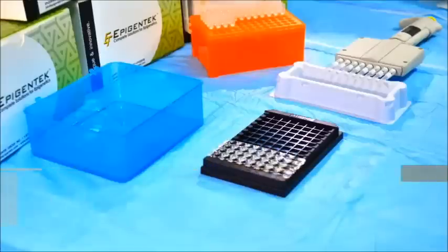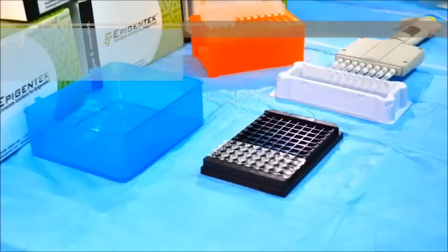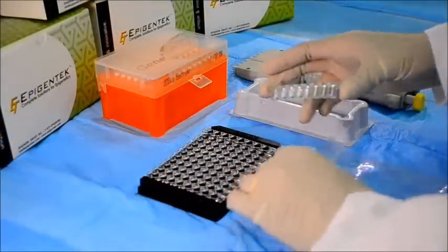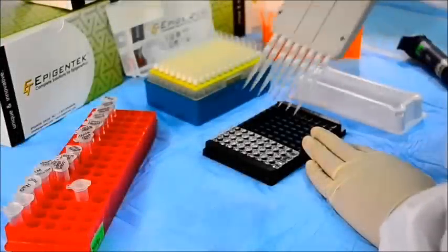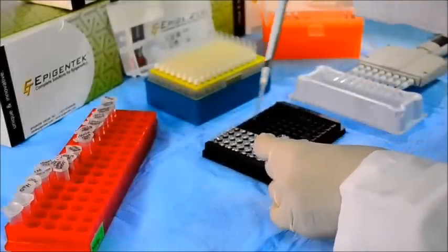The easy procedure can be completed in just four hours in a flexible strip well microplate format for either manual or high-throughput analysis. Begin by removing unneeded strip wells from the plate frame, add the binding solution to the wells, followed by addition of DNA samples and the included positive and negative controls.